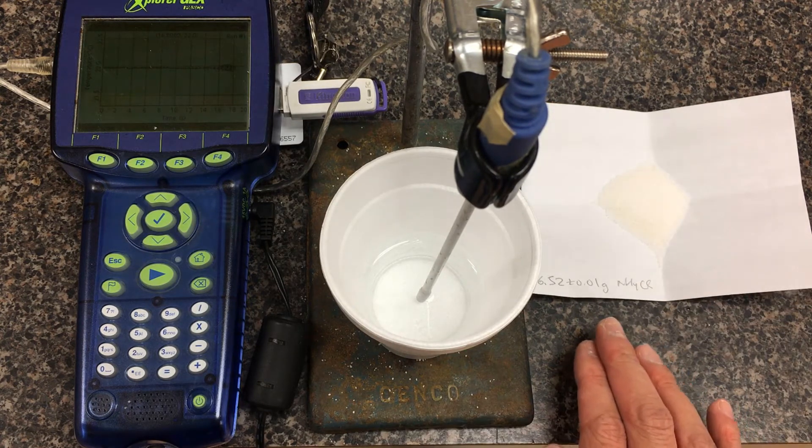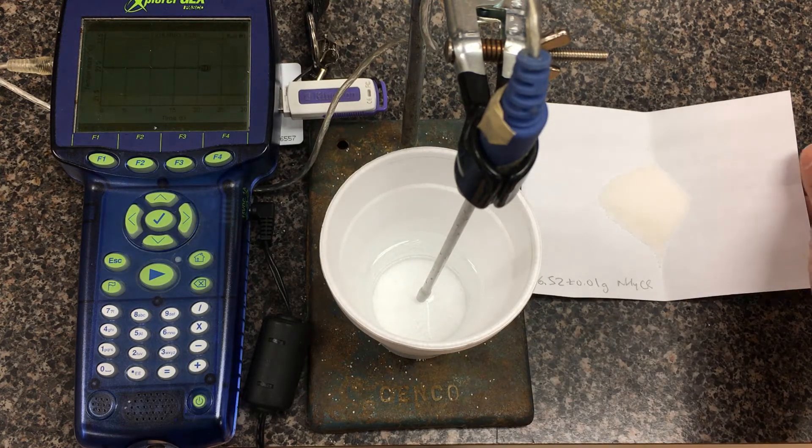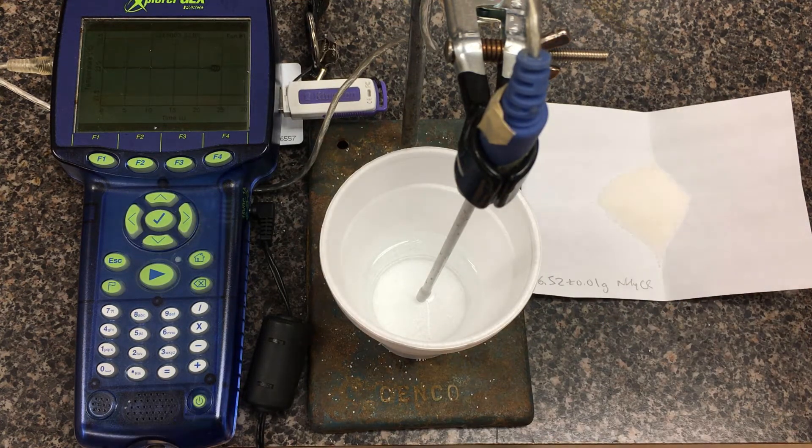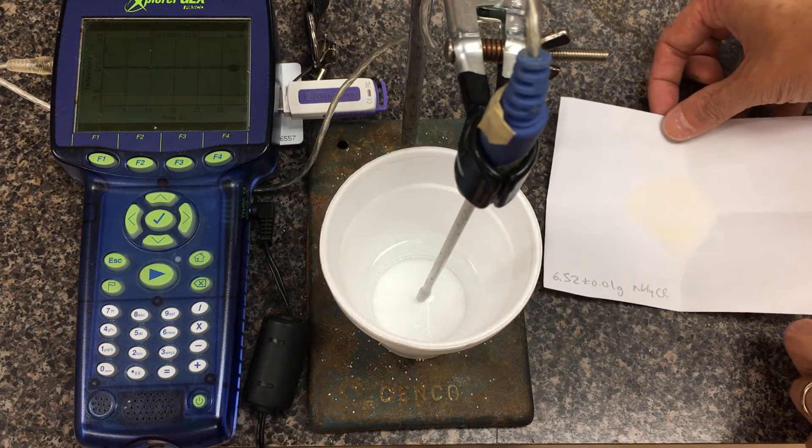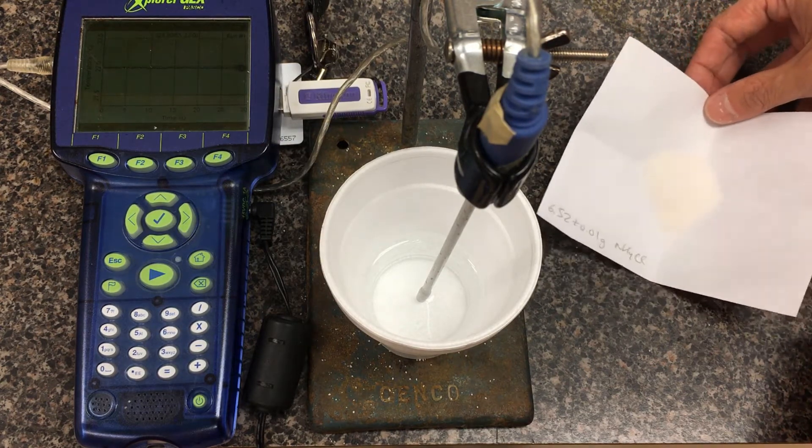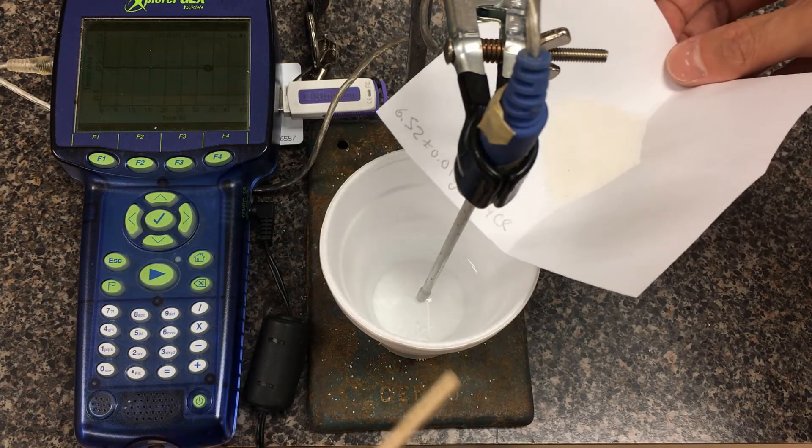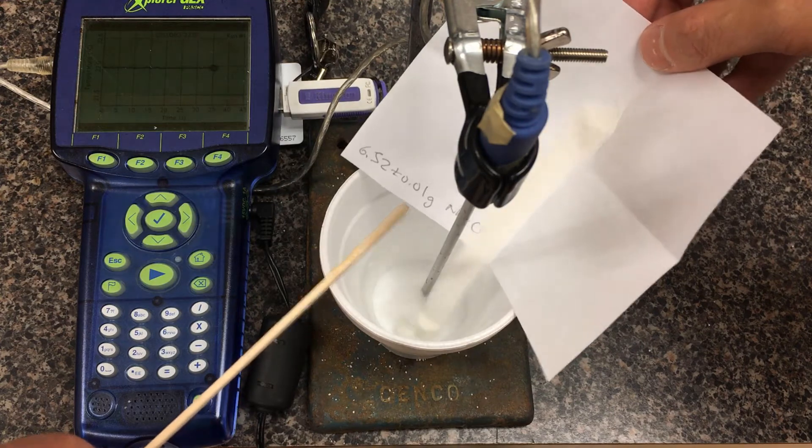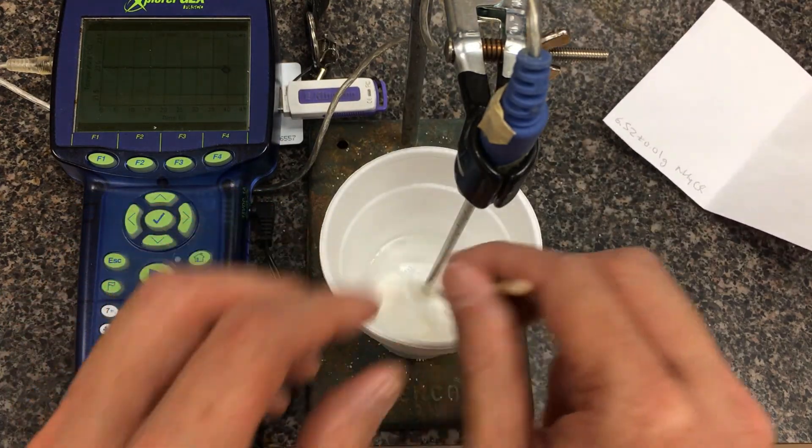I've weighed out 6.52 plus or minus 0.01 grams of ammonium chloride. I'm going to slowly drop in this powder. We have a wooden stir stick ready to help with the dissolving, and we'll be monitoring on the GLX sensor in real time what happens to this temperature. Let's just slide it in.